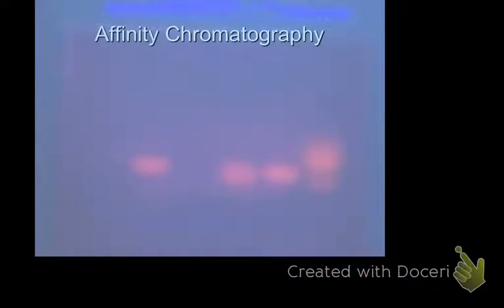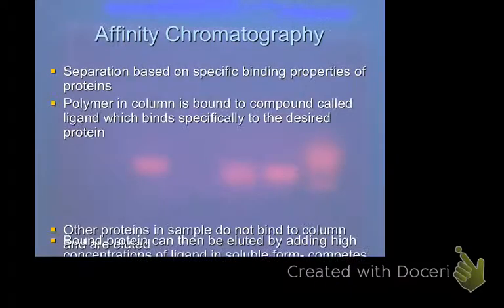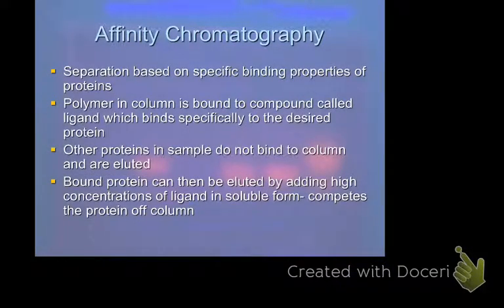So now just for the words. Here it's specific binding of the protein to something. There's a polymer that's usually stuck to a bead that has whatever that ligand is. Ligand is what binds. And other proteins don't have an affinity to it. And then you have to add high concentrations of whatever that ligand is in soluble form to knock it off.